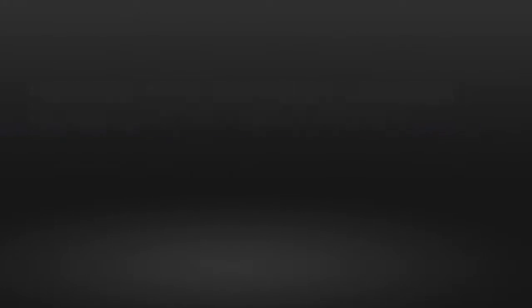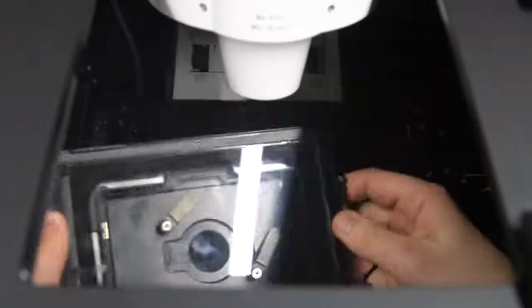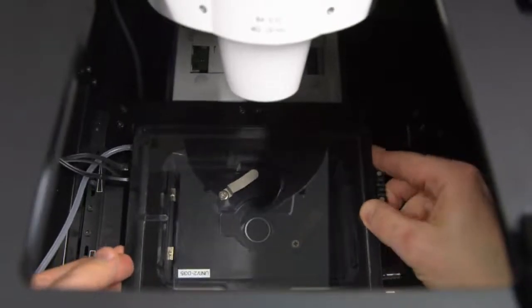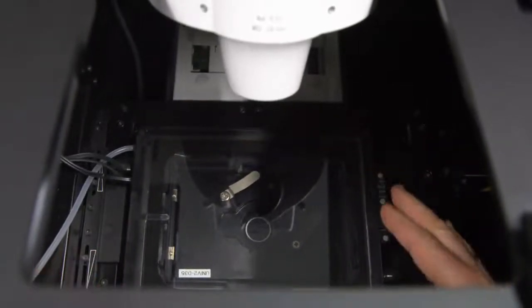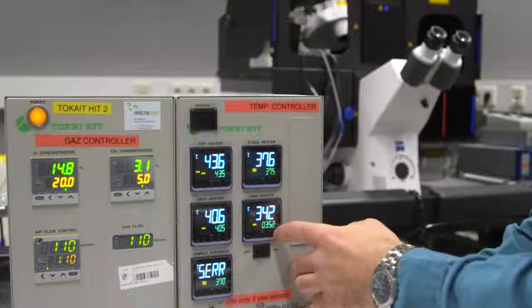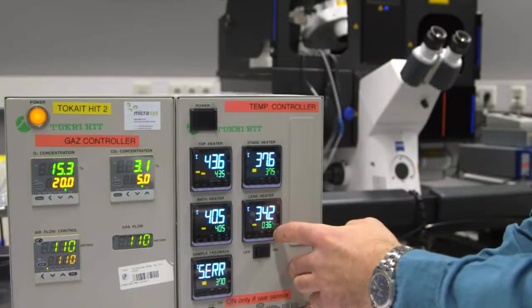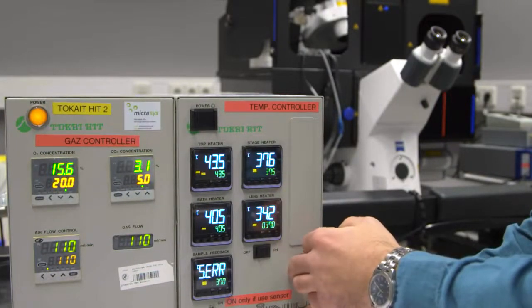For live cell imaging, at least an hour before the imaging session, place a stage top incubator onto the super-resolution structured illumination microscope stage and set the temperature to 37 degrees Celsius and the carbon dioxide concentration to 5%.